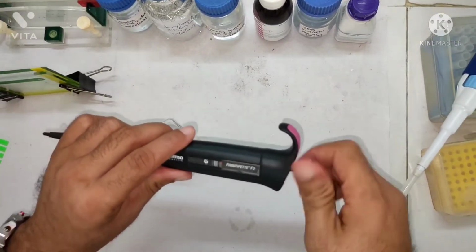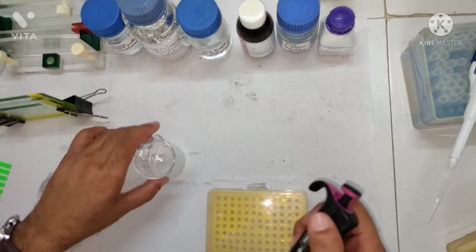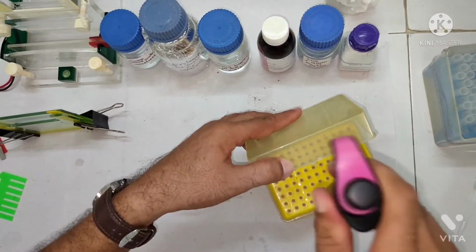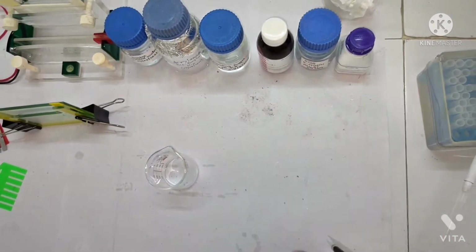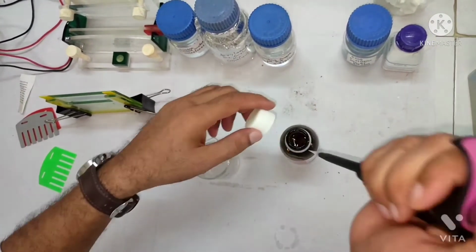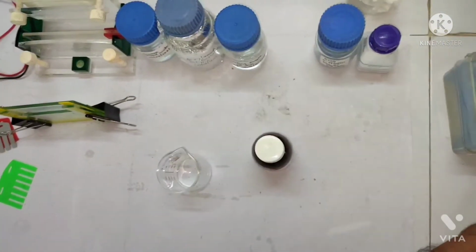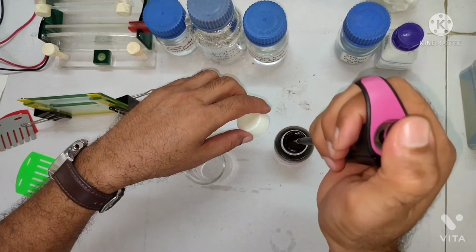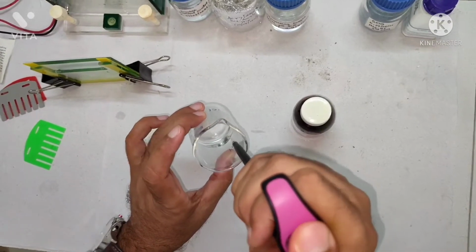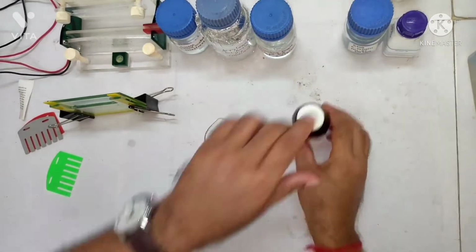So 5 microliter is a very small amount, so you have to take the appropriate pipette. Okay, and the smell of this TEMED is very unpleasant. So this tip would be all right for this pipette. Then we have to take TEMED. See, this is the TEMED. Okay, so open it and take just 5 microliter. Oh, the tip has gone inside. Okay, and you put it inside and then you press the pipette and mix it well. So TEMED has been added.